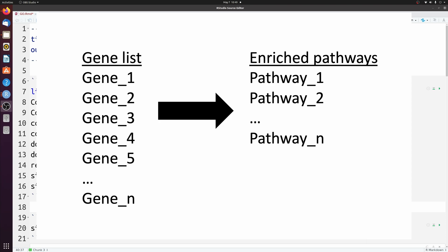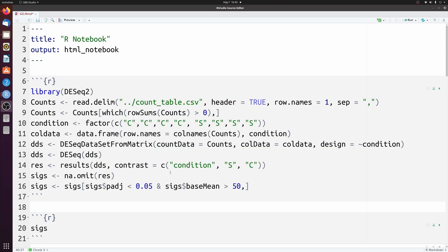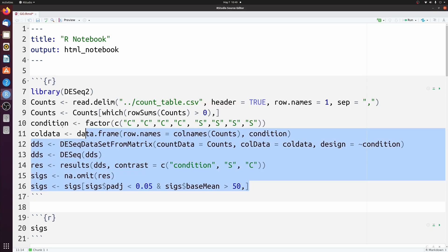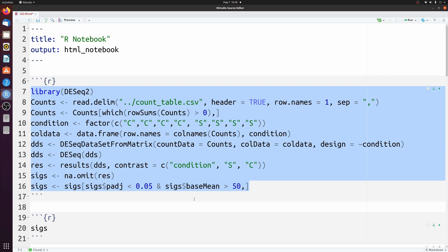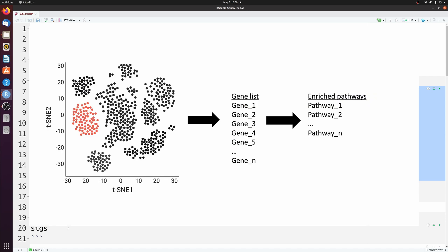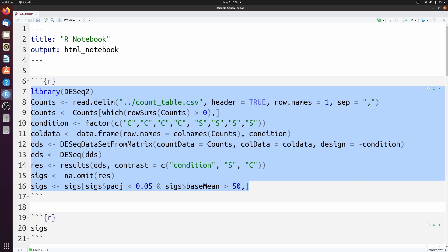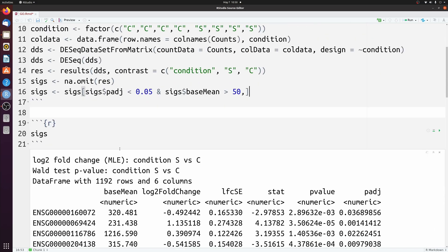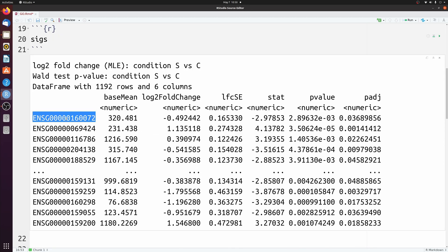All we need is a list of genes. For the example I'm using today, I'm doing a basic DESeq2 differential expression, but you could do this with single-cell sequencing as well — maybe the markers for an individual cluster or the differential expression between different groups of cells. It doesn't matter, as long as you have a list of either gene symbols, Ensembl IDs, or Entrez IDs. Looking at our significant genes, we can see we have Ensembl IDs here, so we won't need to convert these.